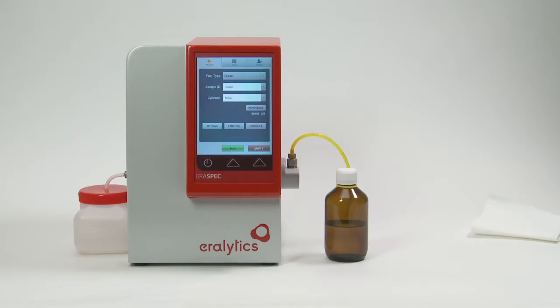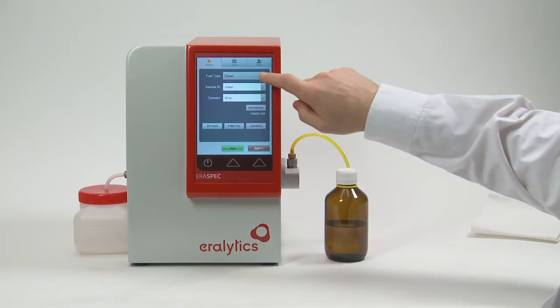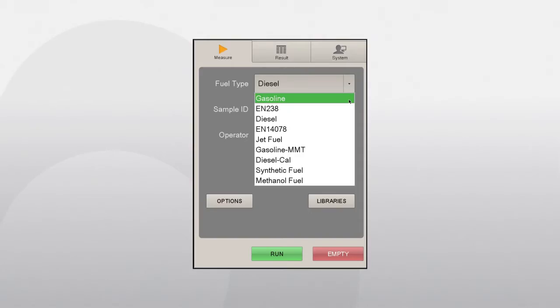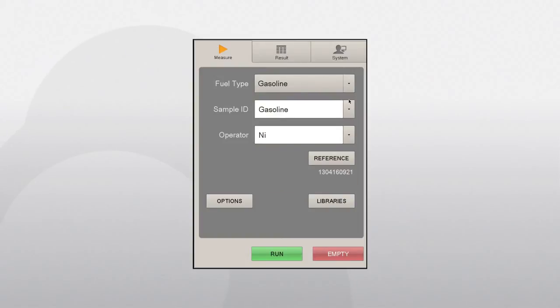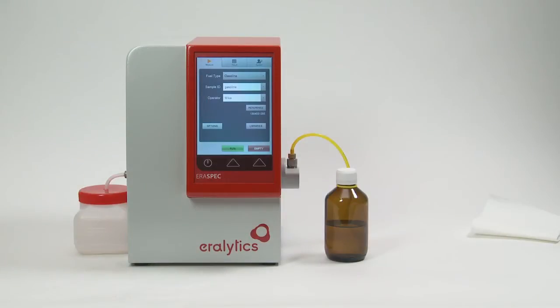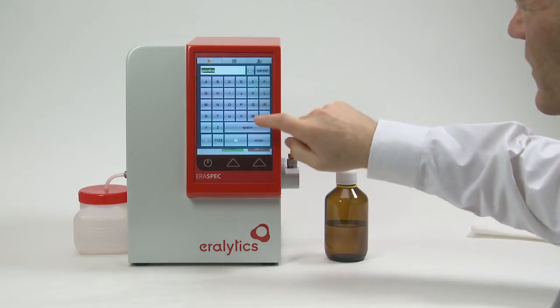The first line of the measure menu displays the type of fuel to be analyzed or the method used for the measurement. If you want to analyze a different type of fuel or use a different method, select the desired measurement method from the drop-down list. After each change of the measurement type, the AeroSpec will usually measure a new reference. Always wait until this measurement is finished.